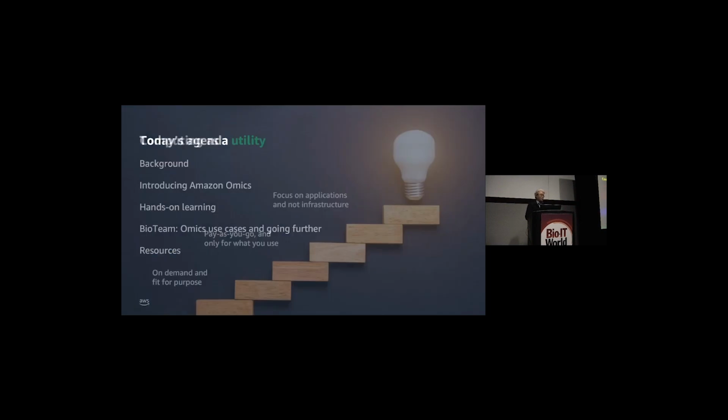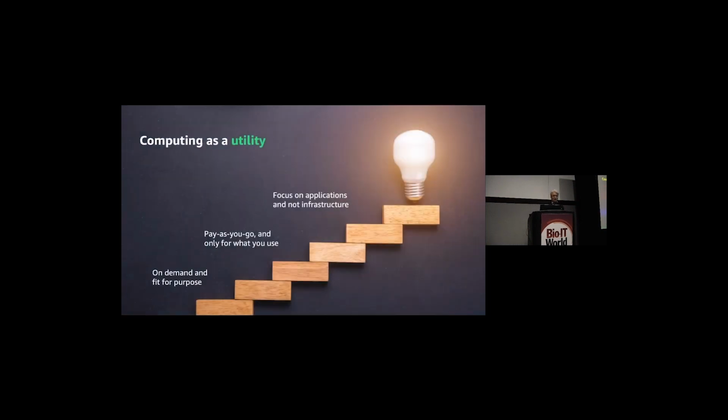All right. So I like to level set for folks that might not have raised their hands as to what AWS is. AWS is a cloud computing service provider. You can think of AWS kind of like a public utility, but for computers. So you get computers that are on demand, fit for purpose. They come with pay-as-you-go pricing, and you use only what you need at that moment in time. And so what that allows you to do is to focus in on just building applications that work in the cloud.